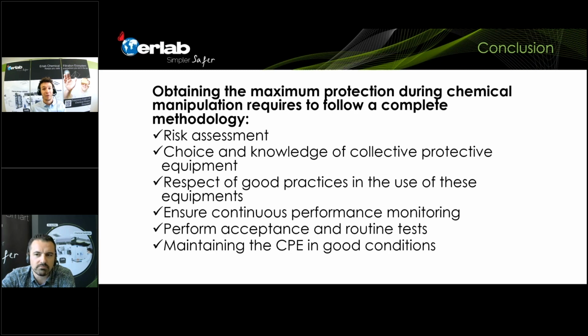Well, that's a really interesting question, because we as experts in molecular filtration or in ductless fume hoods need to estimate. We need to know what you're going to do in the fume hood in order to say, okay, this filter will keep you safe, so it will absorb all the chemicals that you're using in the fume hood.